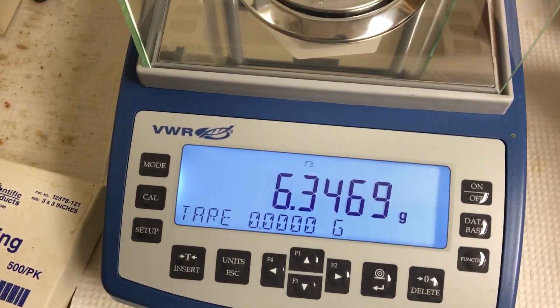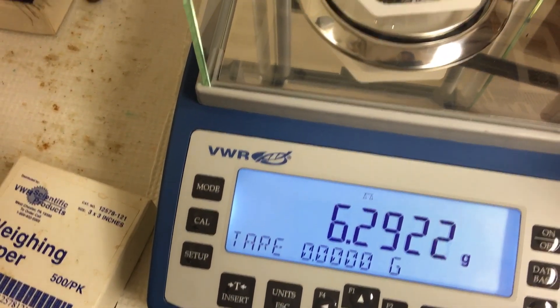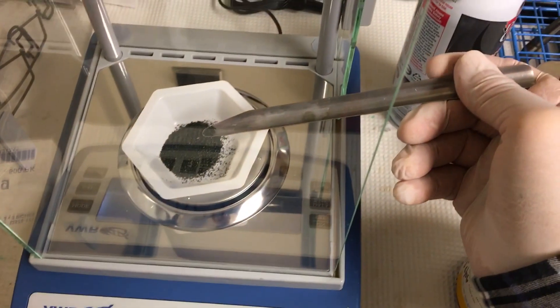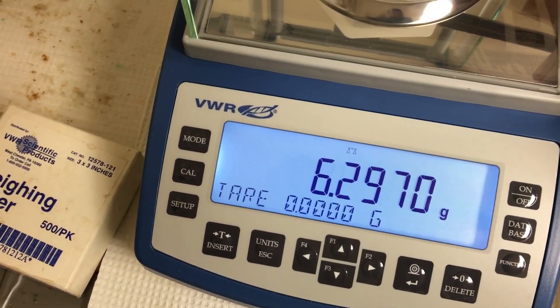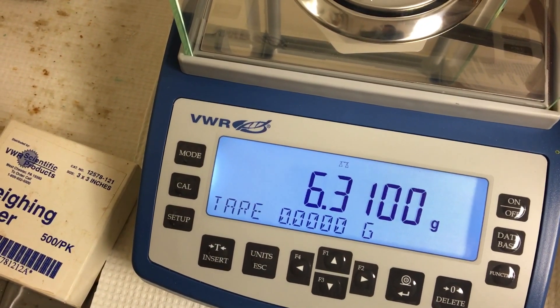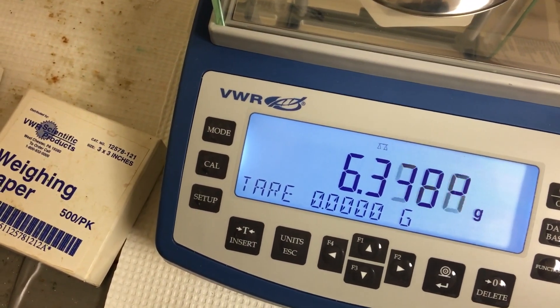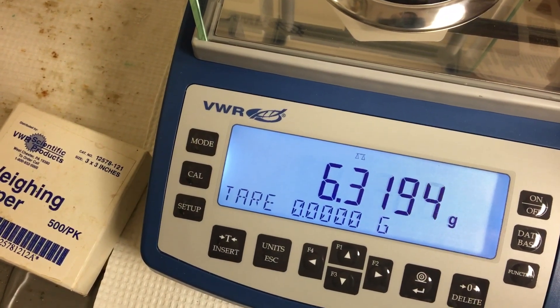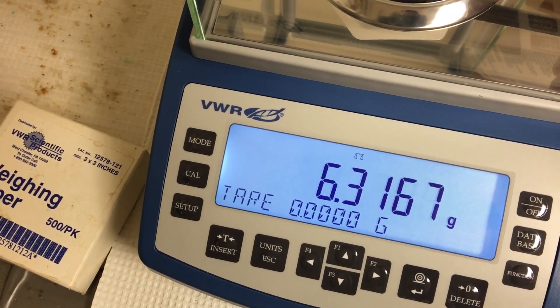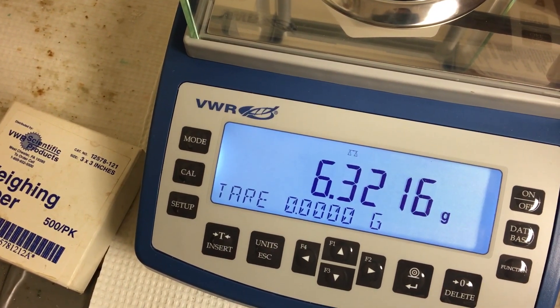It's a little too much, so I'll take some out. Back to 6.3. The way I do it, I just tap the spatula here — a little tap — and it drops small grains onto the weigh boat. Remember the target is 6.322. Still a little off, need a little bit more.